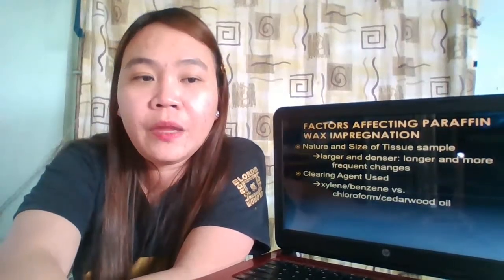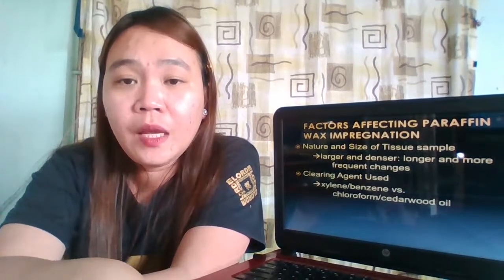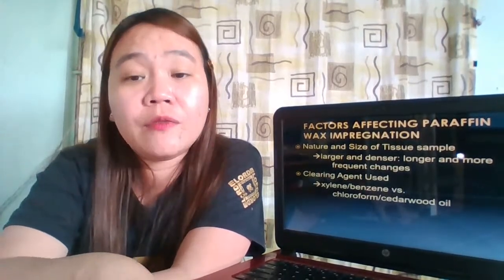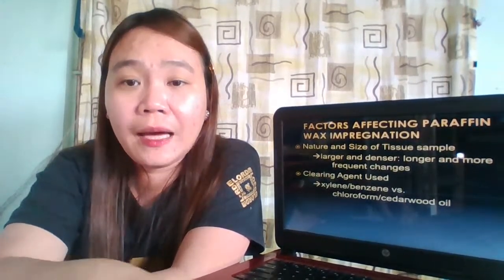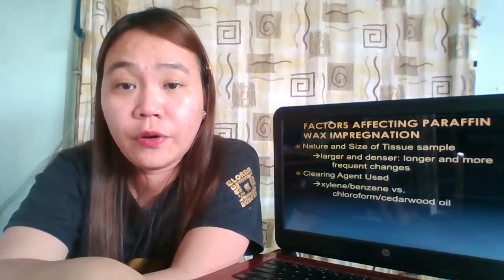So those are the different factors that affect the process of paraffin impregnation, as well as the type of paraffin wax that we have to make use of. Okay.